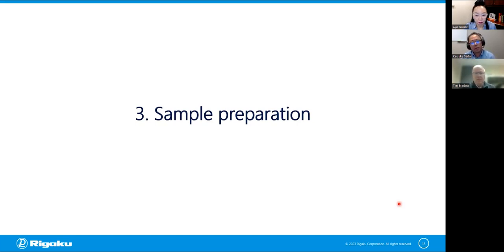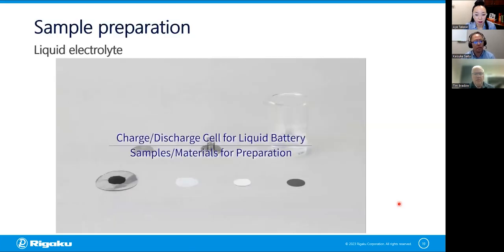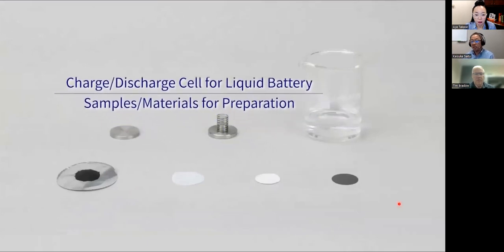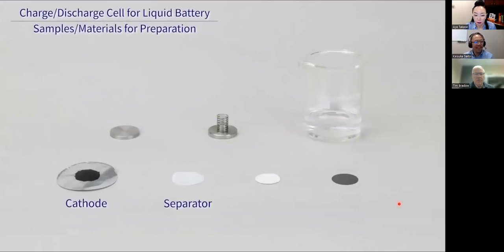In this part, I'm going to discuss sample preparation, because sample preparation is kind of key to success in the operando X-ray diffraction experiment. To be clear, I prepared a couple of different videos for today. Let me share the video with you. I'm going to explain step-by-step how you could prepare your sample structure. Let me start from the liquid-based lithium-ion battery case. There is no sound, just in case you wonder.